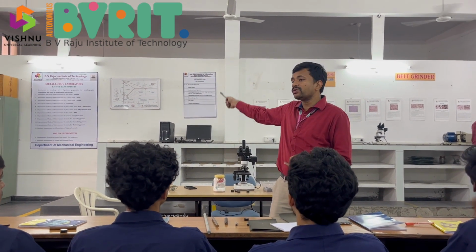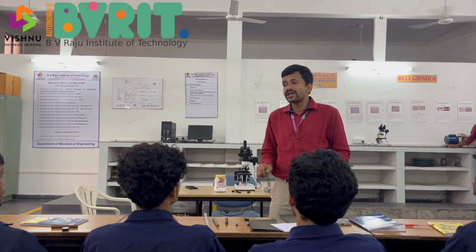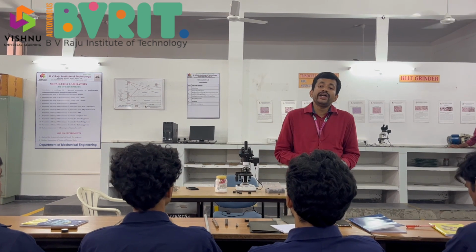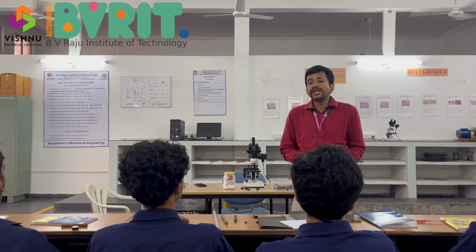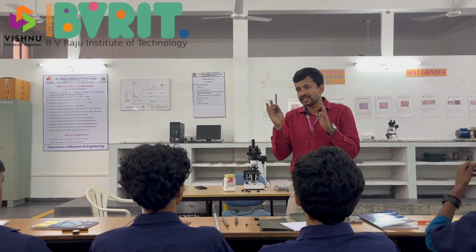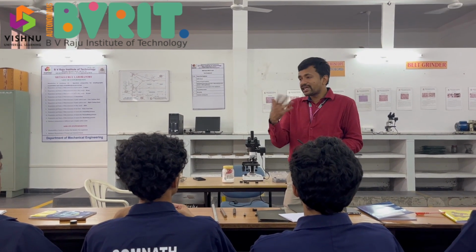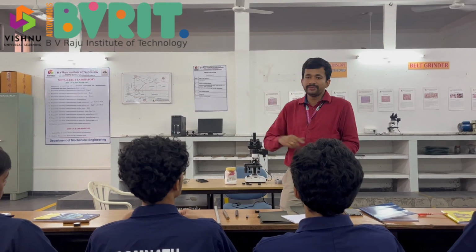We are only looking at a few metals in this lab, but there is a complete picture of all the metals and their respective etchants to be used. Similarly, you need to draw the schematic diagram of the microscope's construction in order to understand its working principle and how to use it. Only this microscope and that table.